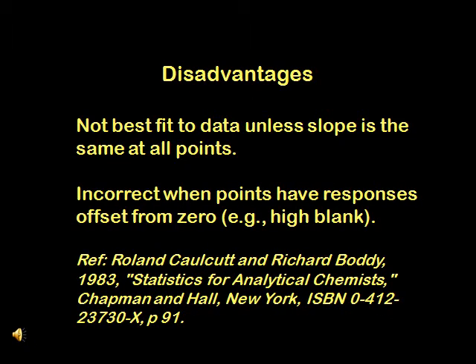Disadvantages. 1. This model does not work unless the slope is the same at all points. 2. This model also does not work when there is a high blank value because the responses are offset by that blank value from the 0 point.